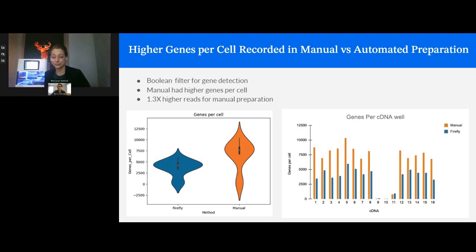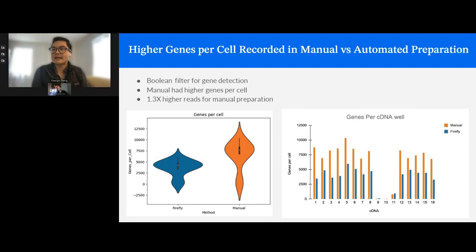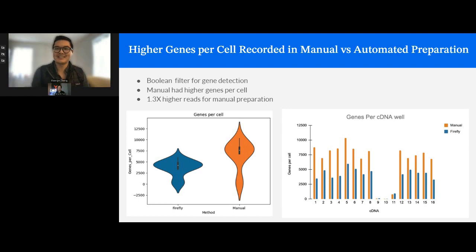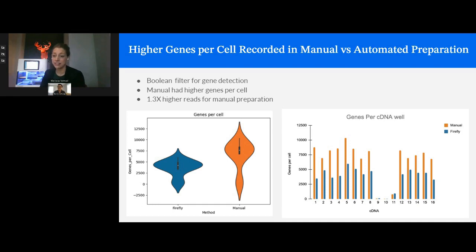Cool, thank you. I guess the next one is a technical question. Are the Z heights adjustable? The Z heights for the dispense and the pipetting heads? The tips, yes. Yes. I would be happy to dive into that a little bit more with whoever asked.